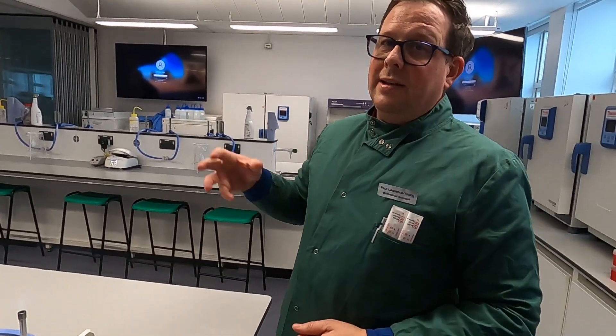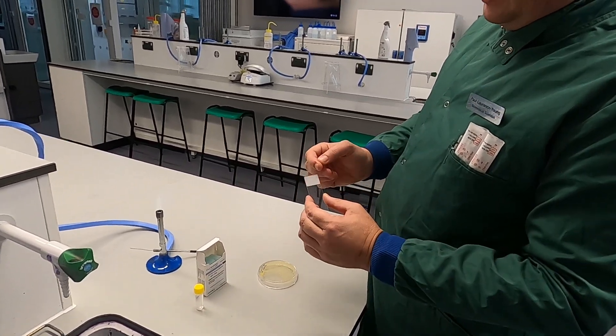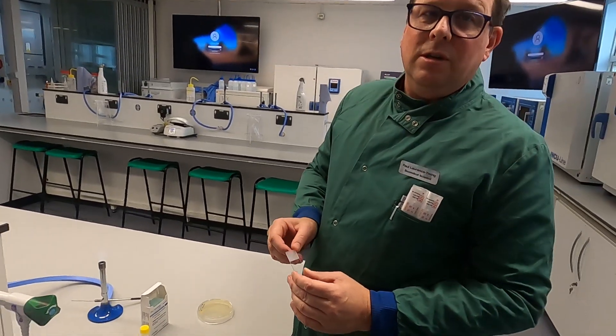Disposable ones obviously don't do that — they just melt. You need a bijou containing distilled water, a slide on which you have actually written something helpful to let you know which way is up, and of course your bacteria.